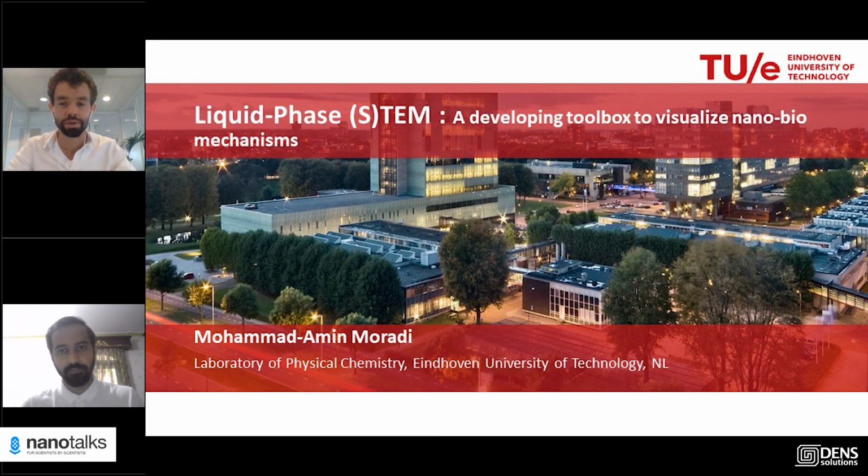We have a question from the audience, so let me read it for you so you can answer that. It's from Ahmad Reza Motezaker, and he thanks you for the presentation. He says, in case of colloids with low contrast particles, not heavy and transparent ones, and fast moving dynamics, will graphene cells be beneficial?